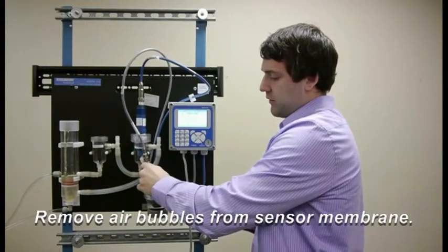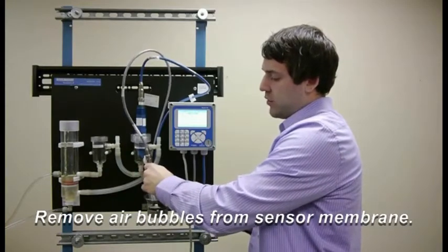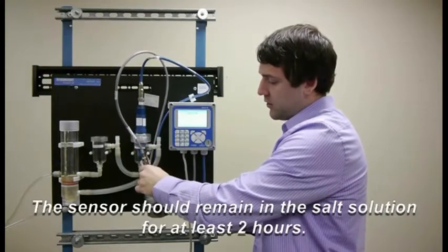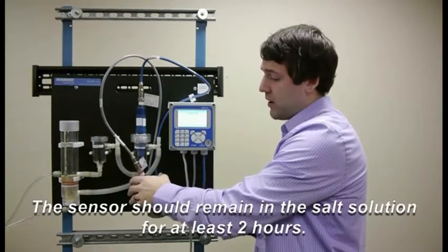You're going to need to swirl the sensor around a few times so that no air bubbles are trapped on the membrane head. Then you're going to leave it in there for a minimum of two hours.